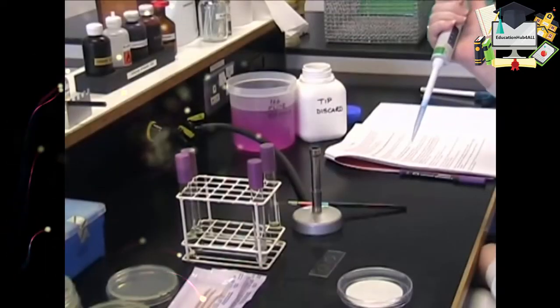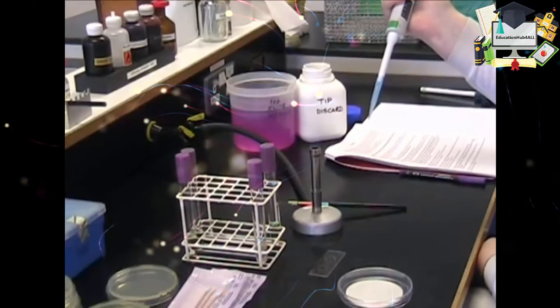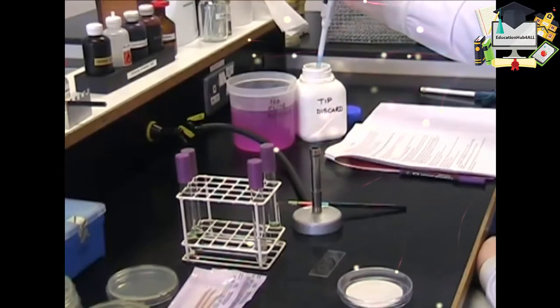It's extremely important to discard any contaminated materials that you might have used during your practical in the correct manner. For example, here we have a Gilson tip, which we've used for transferring liquid. We must make sure we place this in the tip discard pot provided.